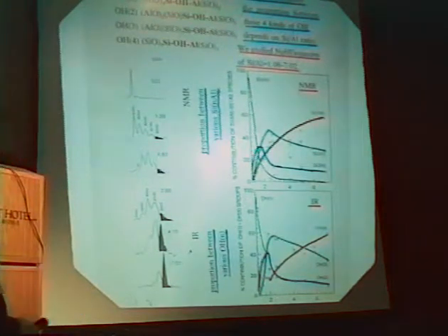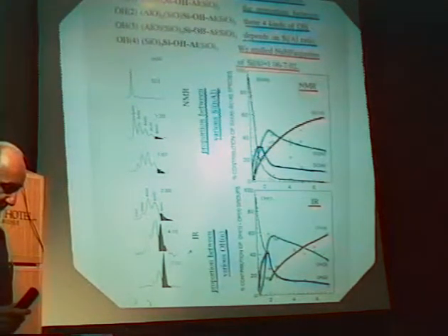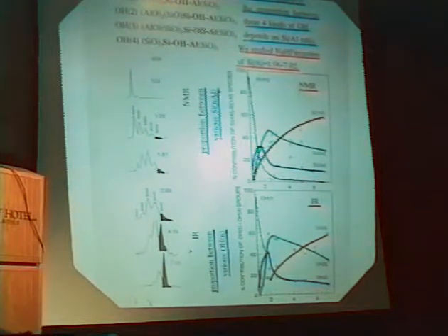We can see how good is the correlation between NMR data concerning skeleton silicon and IR data concerning bridging hydroxyls. Not only the shape of the line is the same, but also the absolute values are very close. For example, 60% maximal concentration of this Si species and 60% maximal concentration of corresponding bridging hydroxyl.